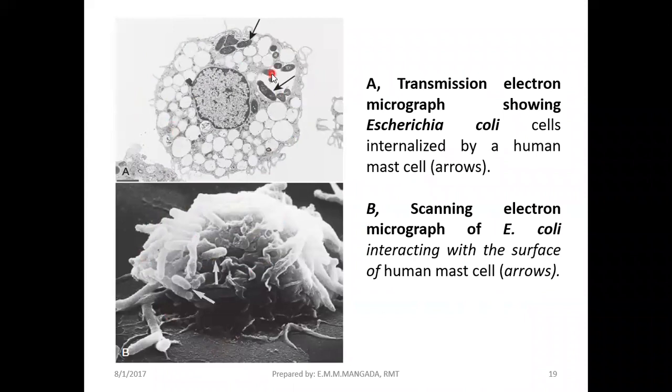Under your TEM, we can see here the presence of the organelles. It's actually your E. coli here, at our arrow. That is what we see at this arrow.